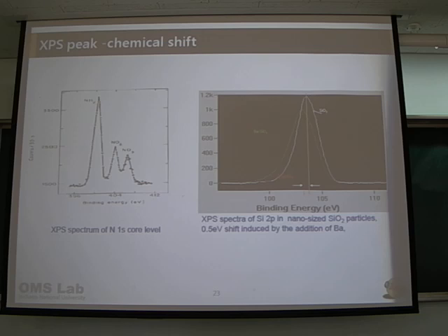We are just discussing. As we discussed today, when you take the XPS, he is talking about only the main peak, but we have seen that there will be some other tails as well. When you observe the peak, there will be some tail as well, which although the intensity is not very strong, how can we ignore this tail, because we only have to focus on the main atom peak, right? Yes. So Gokju just said that, I think Sang-hyun is going here. Sang-hyun was expert in Nawa, but Gokju has done most. So I just asked him how to do it from the menu, from the program, how to eliminate that small tail peak.